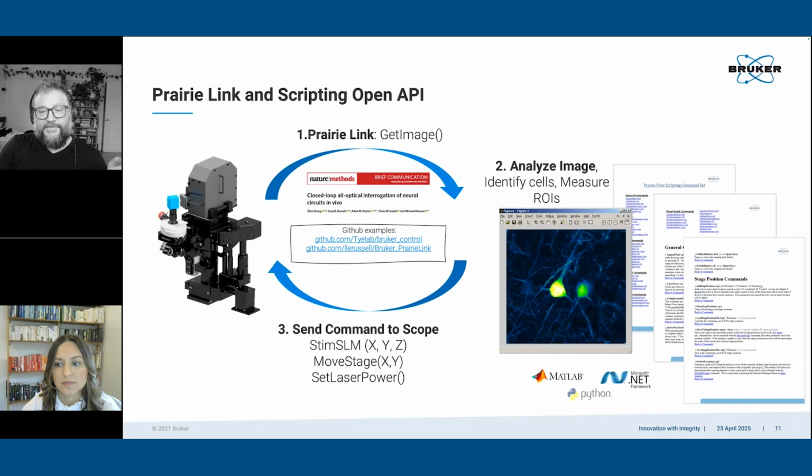I highly recommend people look into the fMRI field, because motion correction and image registration they've worked out really well, and they've been doing it for longer with more funding, it seems. So a lot of human neuroscience packages work really well with 2D imaging data, because at the end of the day, you're just kind of looking for contrast and these sorts of things. And like I said, ANTs can do nonlinear registration and motion correction as well.